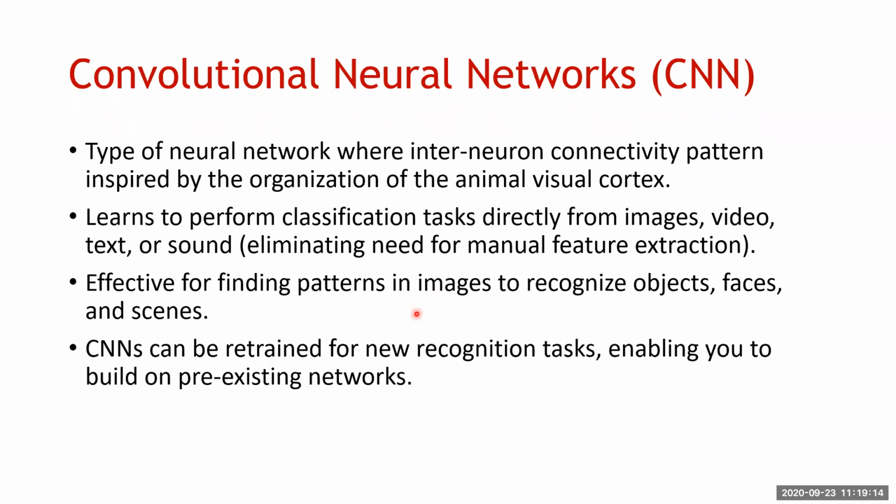It's very effective in finding patterns in these images, such as objects, faces, and scenes, and you can imagine how useful that is for microscopy, because you're looking for patterns in your data all the time. And quite importantly, CNNs can be trained for new tasks that allow you to build on pre-existing networks, and this goes into the transfer learning that I mentioned earlier.